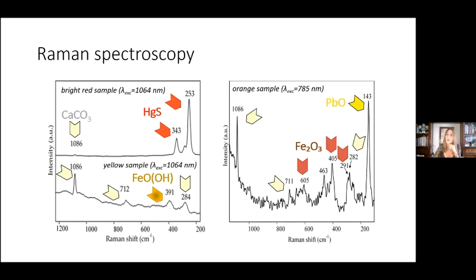cm⁻¹ that was not indicated in the figure in order to simplify the overview of the principal components. I want to highlight that the latter outcomes represent effective examples of the well-known peculiar performance of micro-Raman spectroscopy in the identification of pigments, which is especially evident when they are obtained as mixtures of different substances.